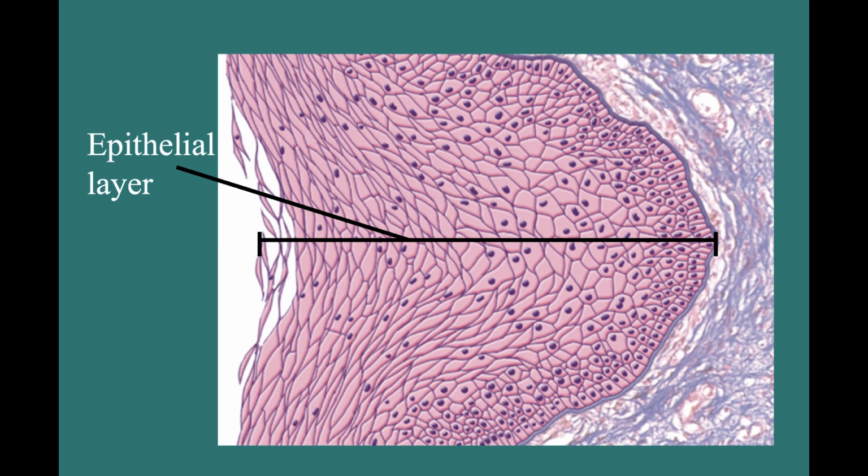Now, one of the other things to note is that you can see we have some nuclei in here, and we also see some cells that don't have nuclei. It can be tricky to say, oh, well, these must be dead and this must be keratinized, but because you're seeing the nuclei throughout these multiple layers, it's a good indicator that that tissue is likely alive. It's just not getting cut through on this image.